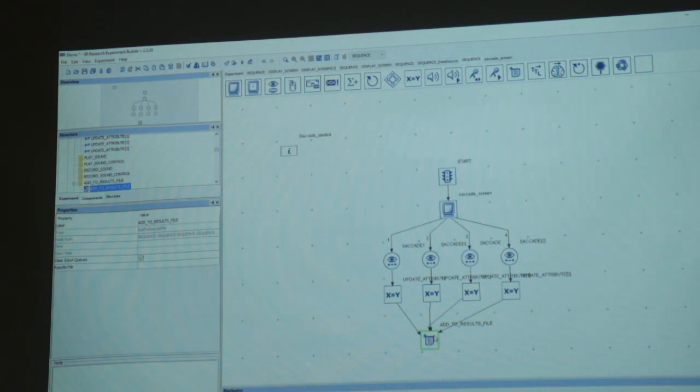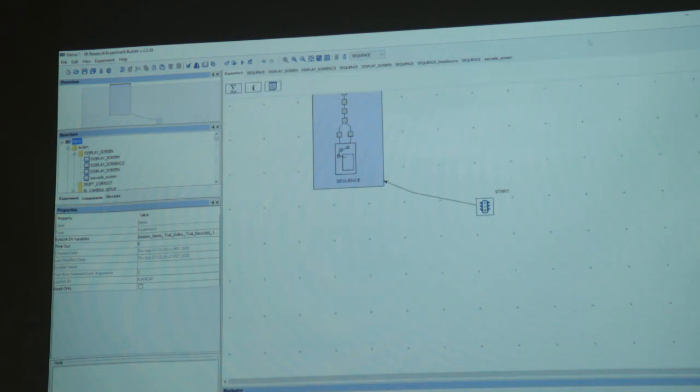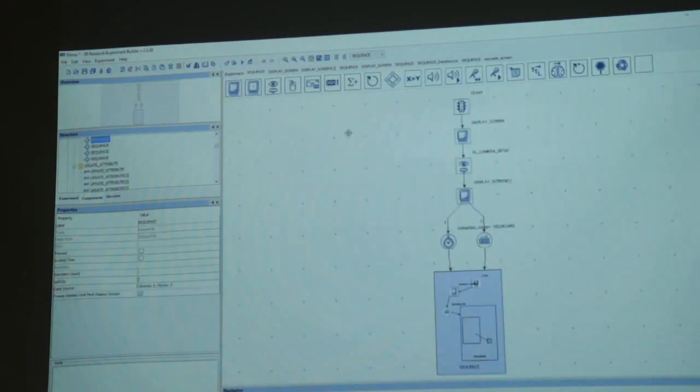Okay, it is critical. So there are 2 icons for result. One is in the action box that you use here in the design, but in the beginning of your experiment, in the very first layer, you go to others and there is another result file which looks very similar, but it's missing the plus on the top. So you just drag one and keep it here. That's it. It just references back to the result. It doesn't have to be connected to anything.